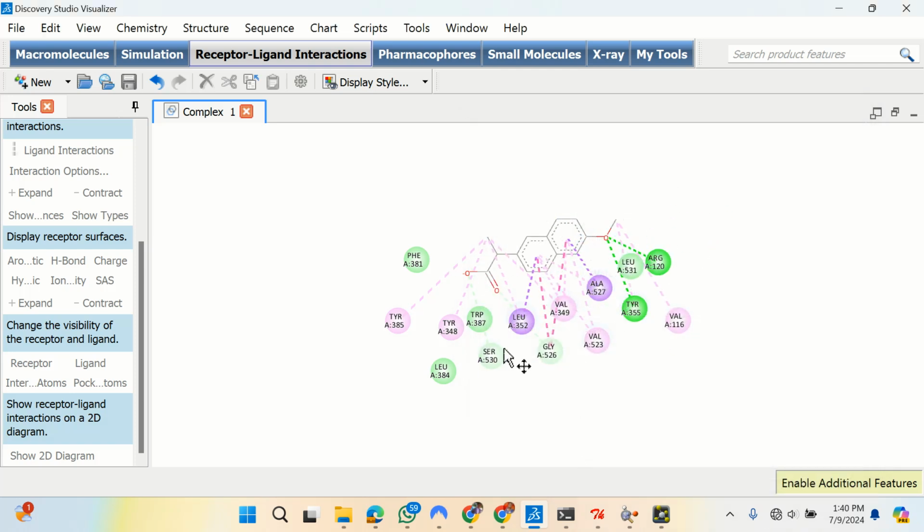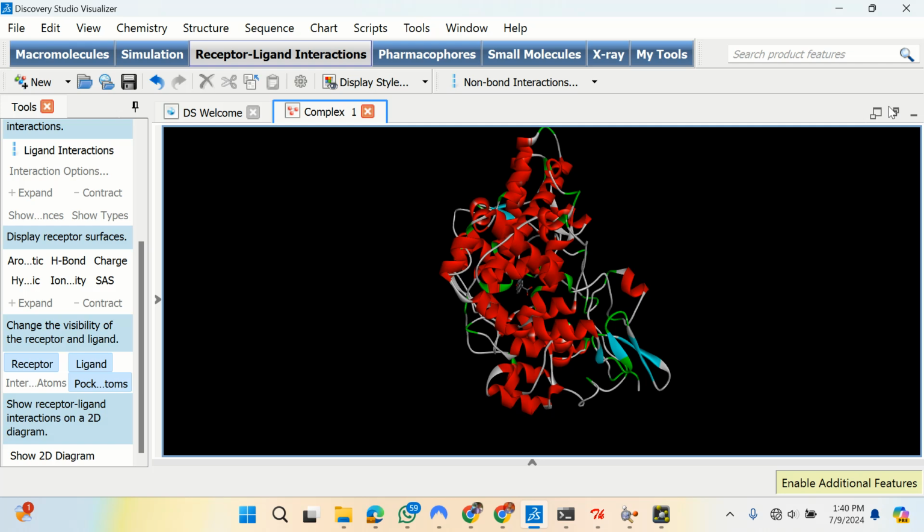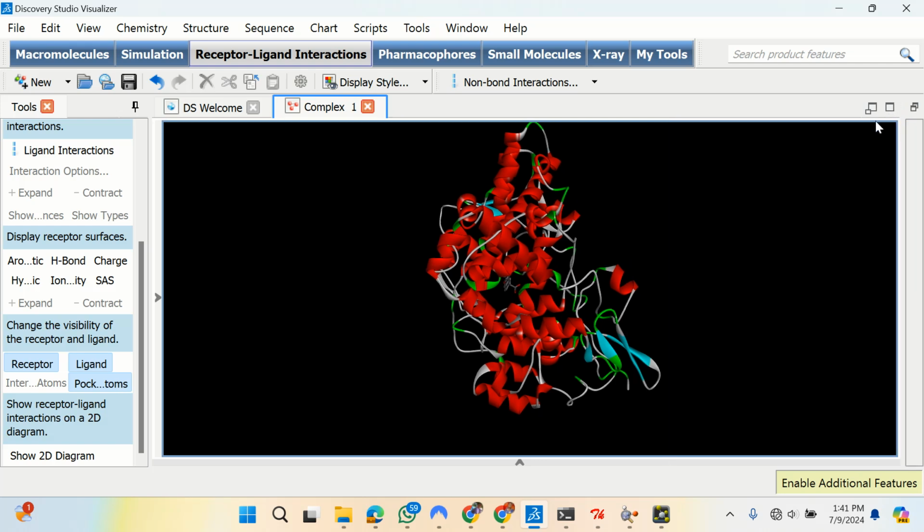Okay. So this is what we have. Just remove that. Okay. So we are going to save this. Then show the second one.